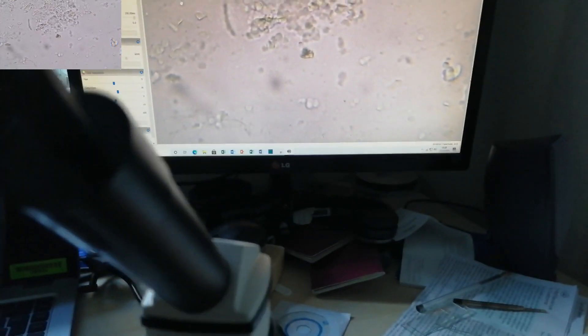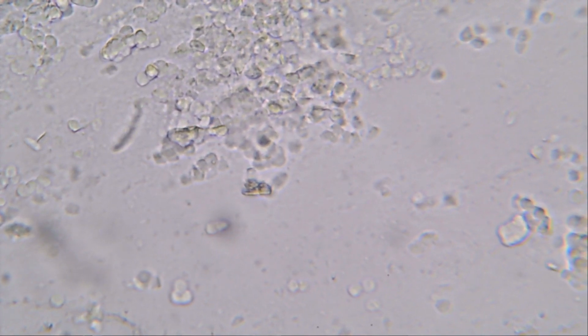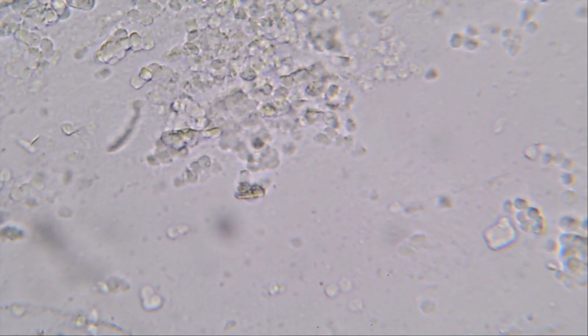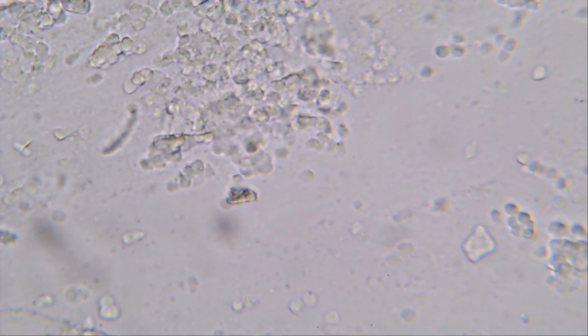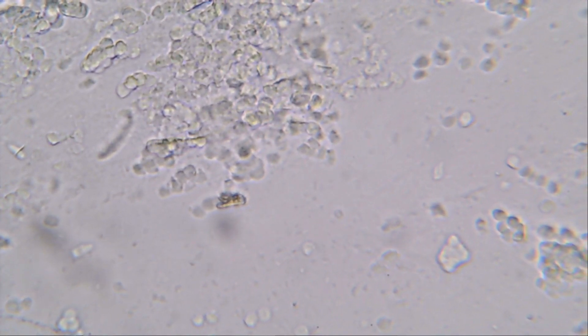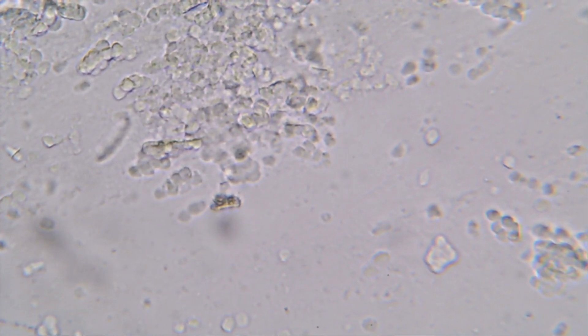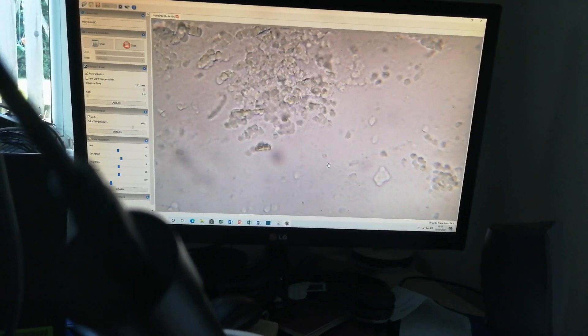So there's another good point to see, there's some scales or cells or, well they're part of the fish, I don't know exactly what they are, but then you've got a nice area of water. Just the movement of water through it. You're just looking for any movement which just doesn't follow that flow. Something like a fluke, this would be a third of the size of the screen so you wouldn't miss that, but smaller parasites you could miss. But it's all looking clean, so that's good news.